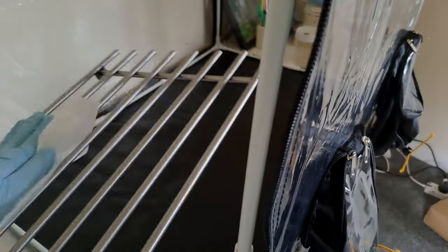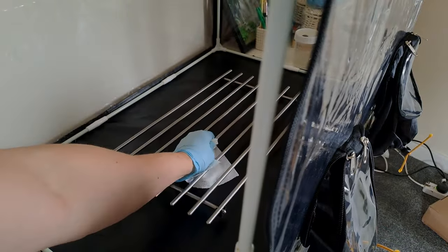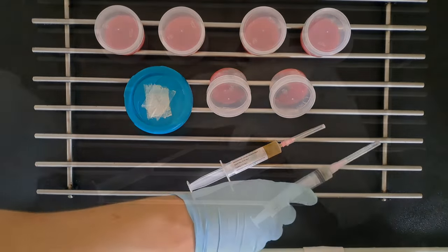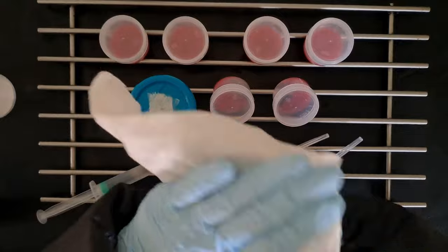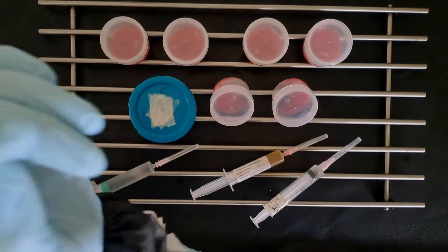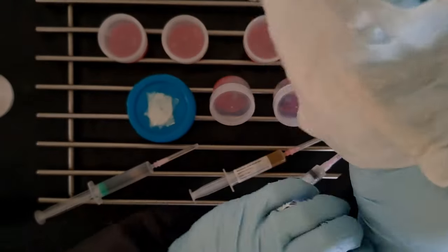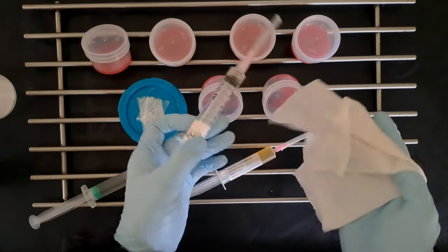Prepare your still air box by wiping it down with 70% alcohol solution and spraying the walls of the still air box with soapy water. Next, place all of the items into the still air box, wiping all of them down with alcohol first. Give everything a wipe down with alcohol.